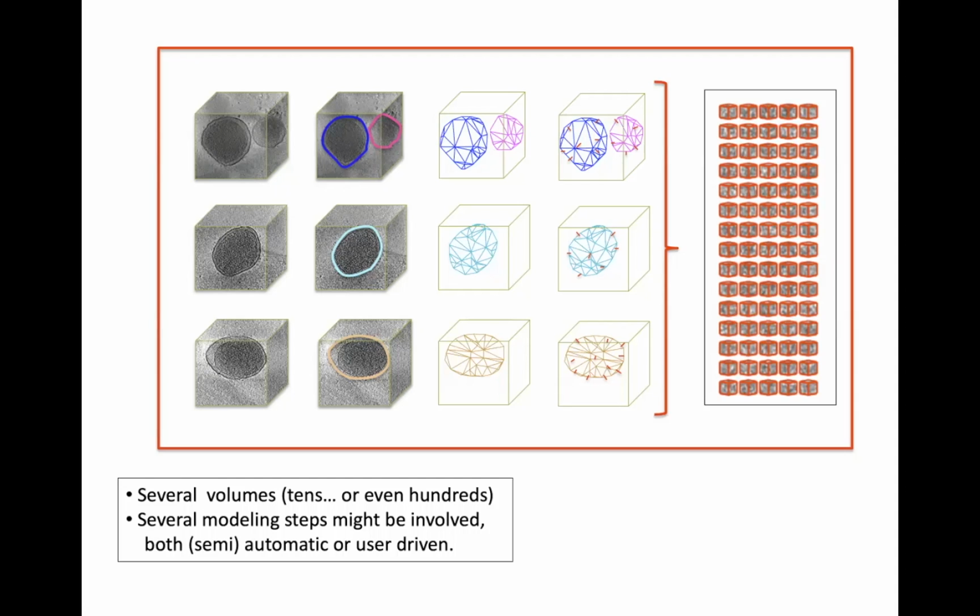You have lots of tomograms, and the path between the tomogram and the individual positions and orientations, if possible, of the different particles is not always trivial. That is one thing. And the other thing is that keeping track of everything that is happening is frequently underestimated at the very beginning by new practitioners of the technique. The data management overhead, just the data management, can be really important.